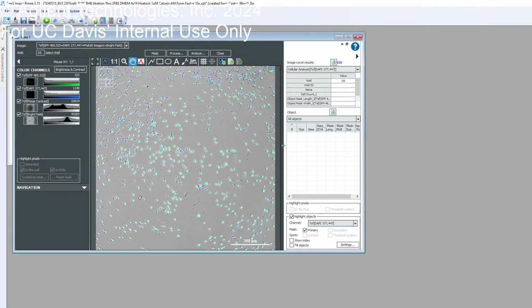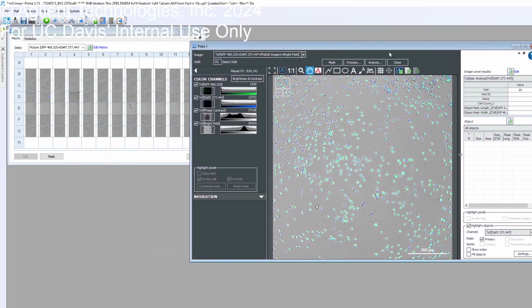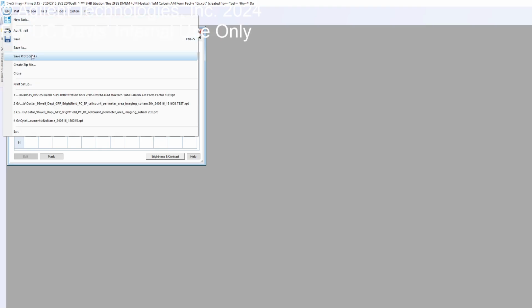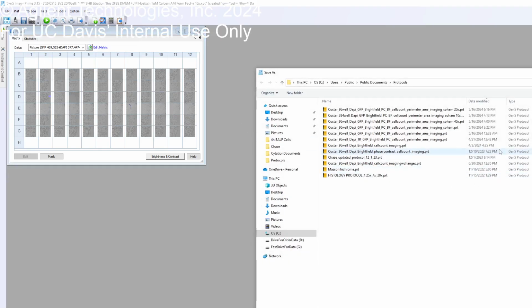And again, you can go back to the subpopulations and try to create different groups if you think you wanna create different groups between circular cells and elongated cells. You can also create groups there, so a lot of options. Then you can close this tab, and save this as a protocol for now, so you don't miss it. And in that protocol, you can further add beacons if you would like, or something else.